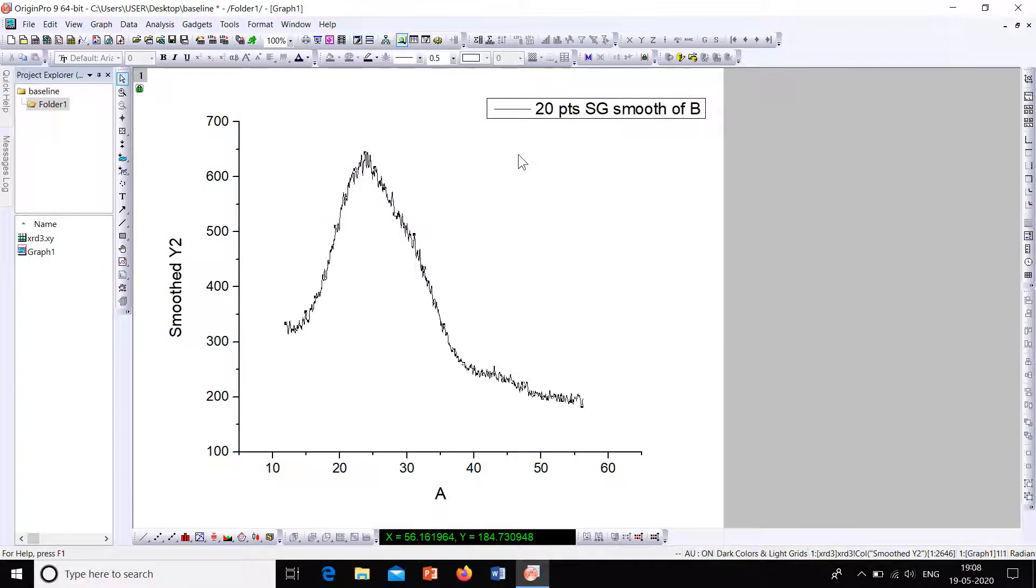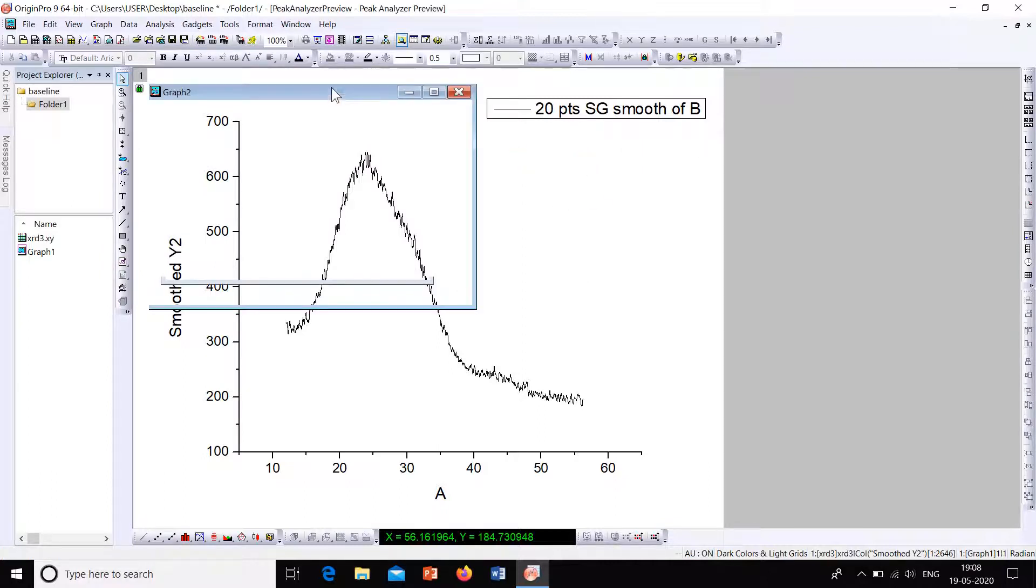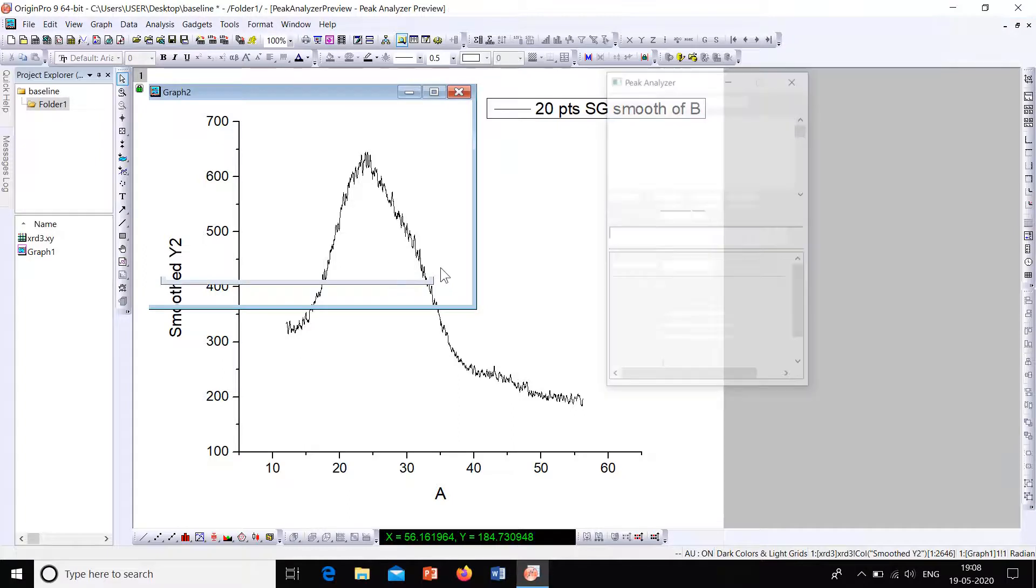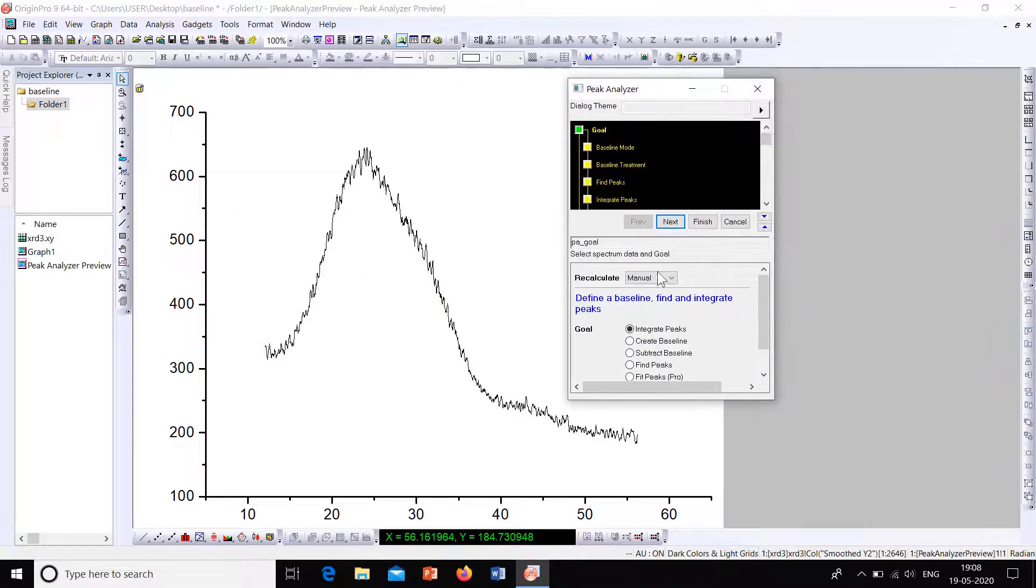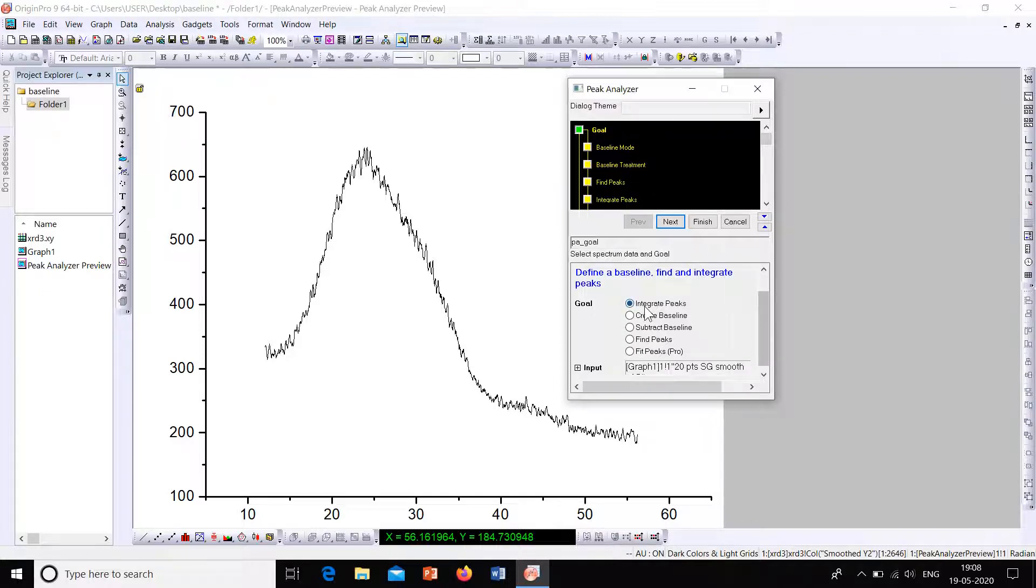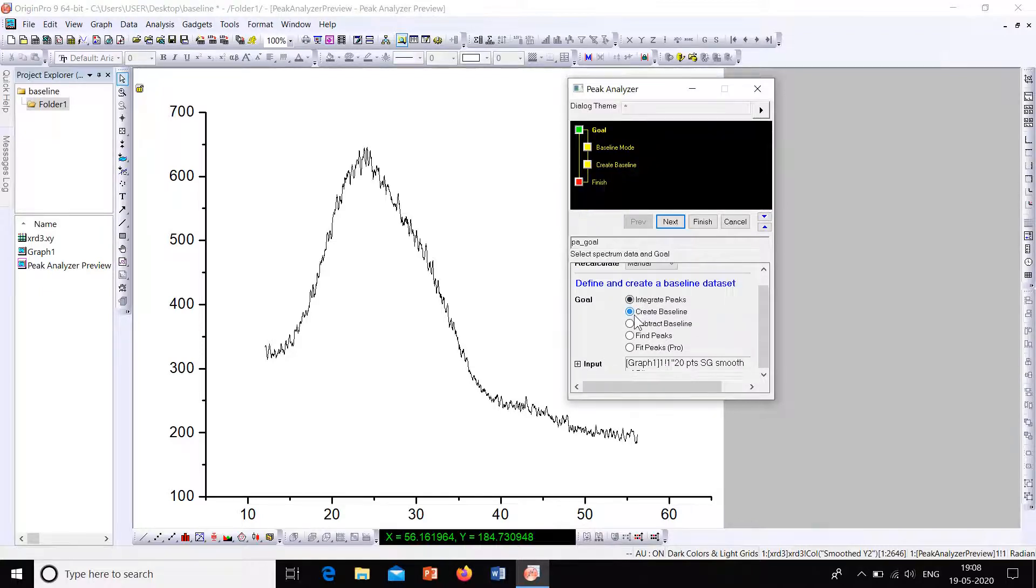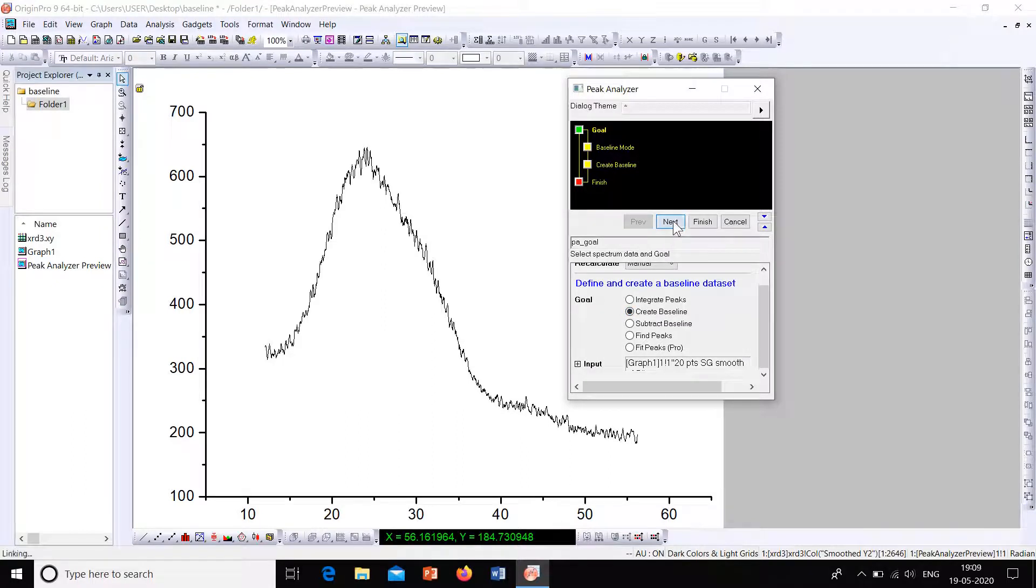Now we will have a window. So this is the window. Here we have to give the inputs. Here click onto the option Create Baseline and then click onto Next.